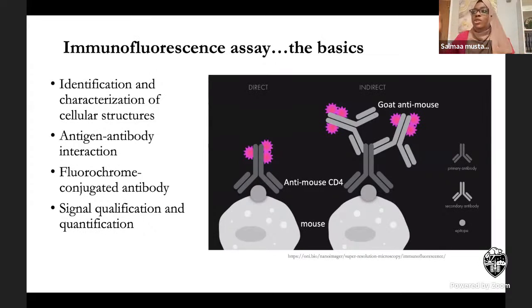Avoid exposure to light. You add DAPI only, right? And that's it, with the PBS. The DAPI is kind of like an oily thing that doesn't dry up your cells. It has a finishing touch that I can't remember right now. That was the only thing that I put, and then I cover it up with foil. That's it. And if I'm too tired that day, I can image the second day.